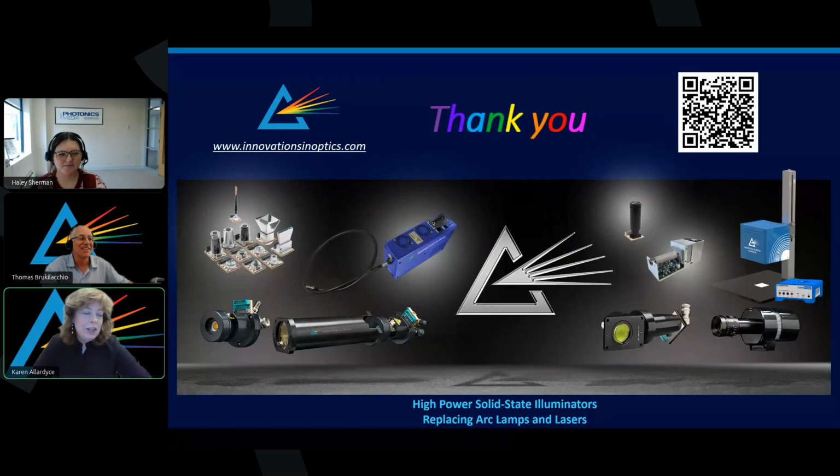There are actually many ways of providing thermal control, right? TECs certainly are very useful for maintaining the wavelength stability and spectral balance. They consume power. They generate additional heat on the hot side. They can be complex and require effective heat removal. So all of those are considerations when we're doing our designs. In higher power systems, they're often combined then with vapor chambers, heat pipes, liquid cooling, and forced air cooling. And that enables them to achieve even higher performance.